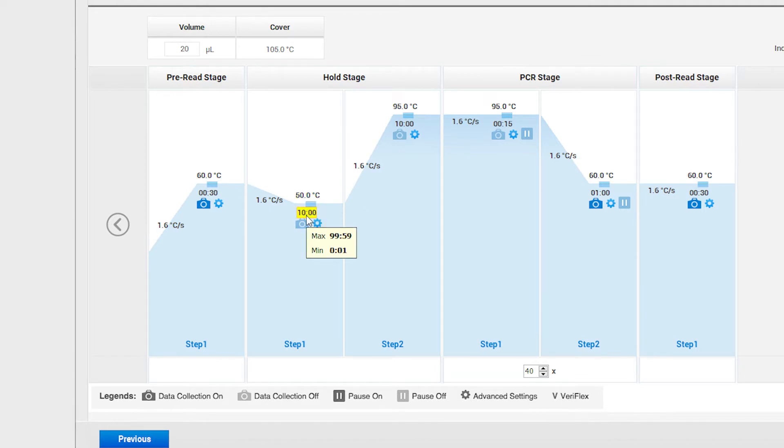If it's not, click on the time and change it to 10. Continue to enter the thermal profiles as recommended in the protocol.